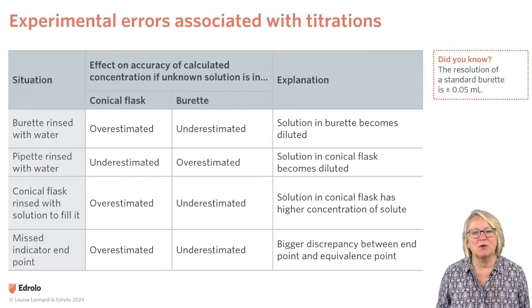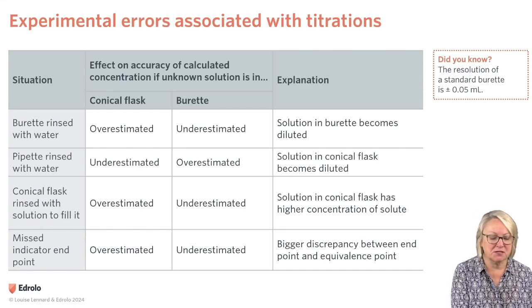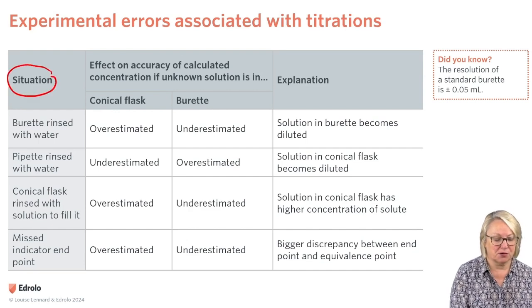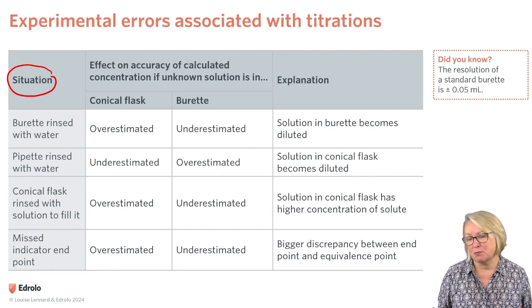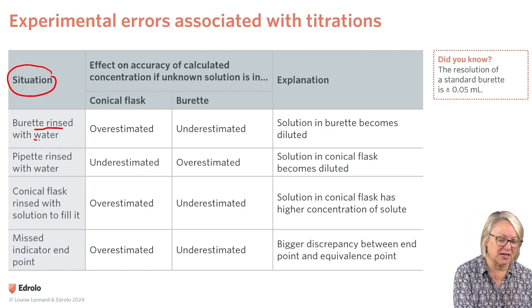Okay, it's important to be aware of some possible errors that occur with titrations, and this is a typical exam type question. So the situation is listed here in this table. So it's got to do with what solution we rinse this glassware with. So the right procedure is to rinse the burette with the solution that's going into it. An error could be if the burette was rinsed with water.